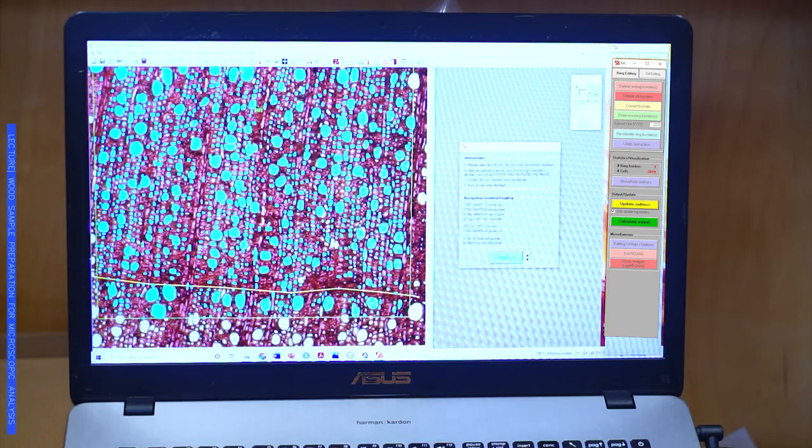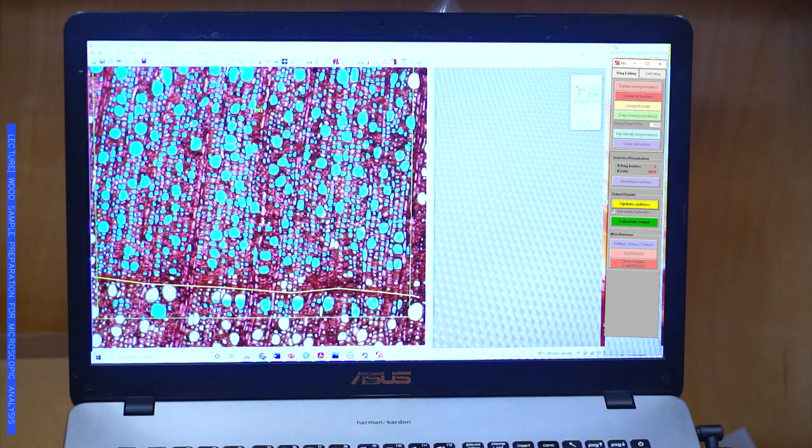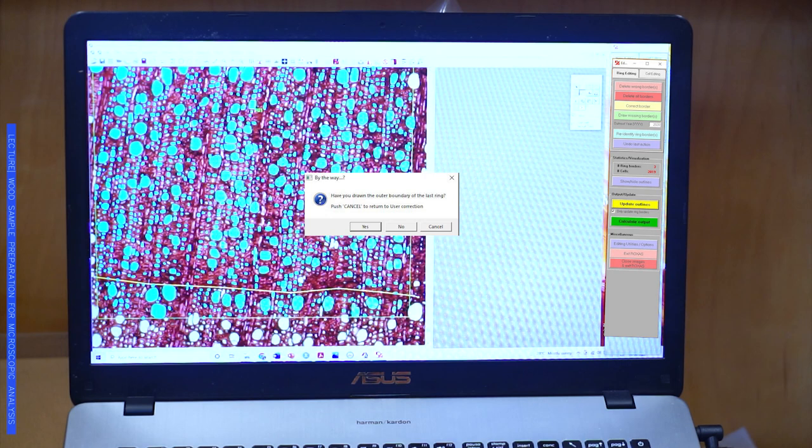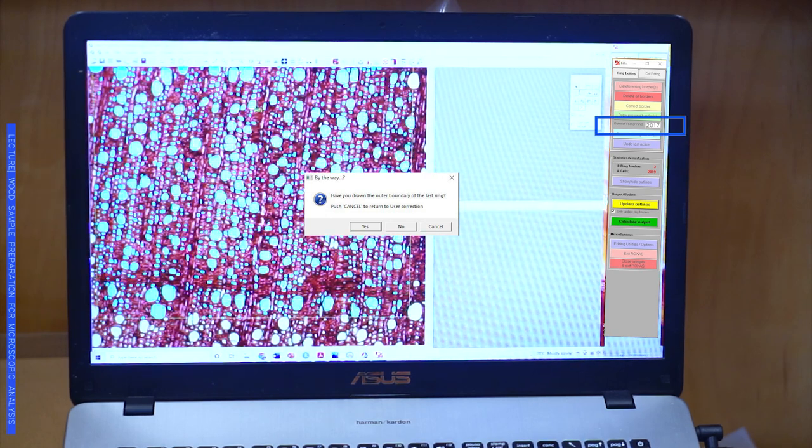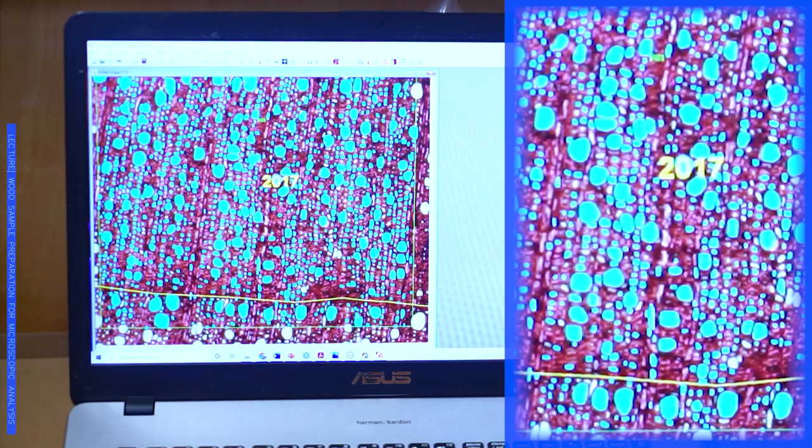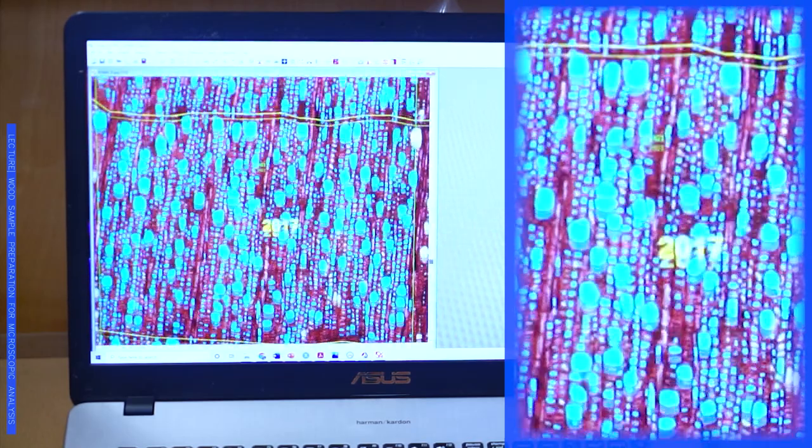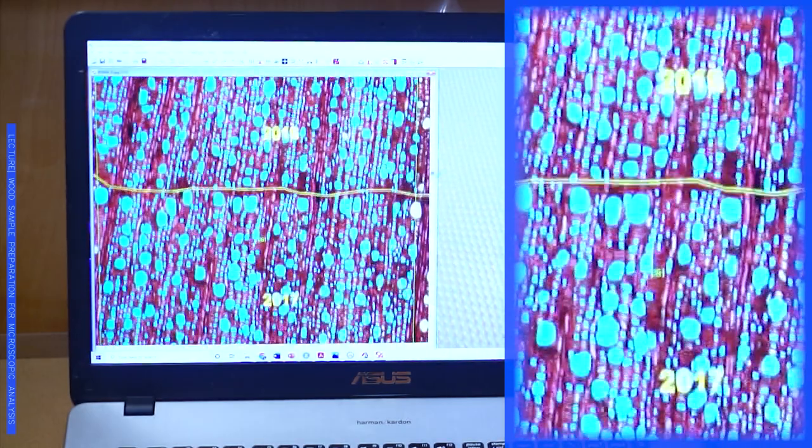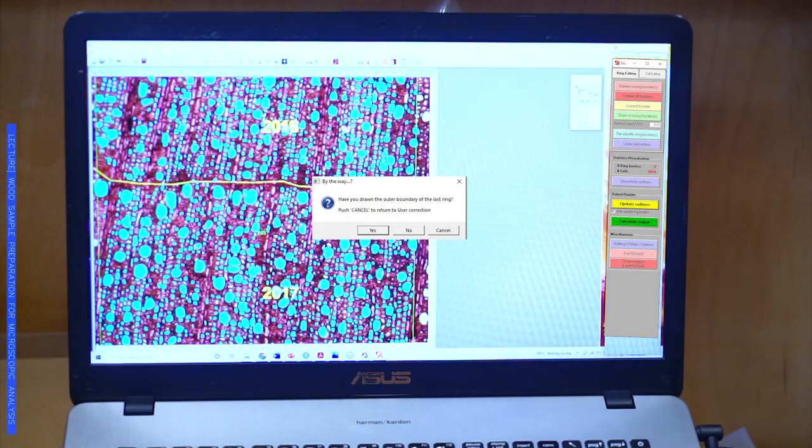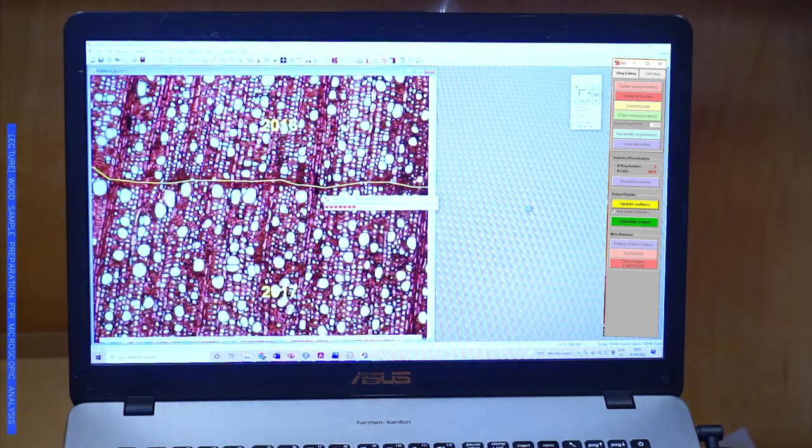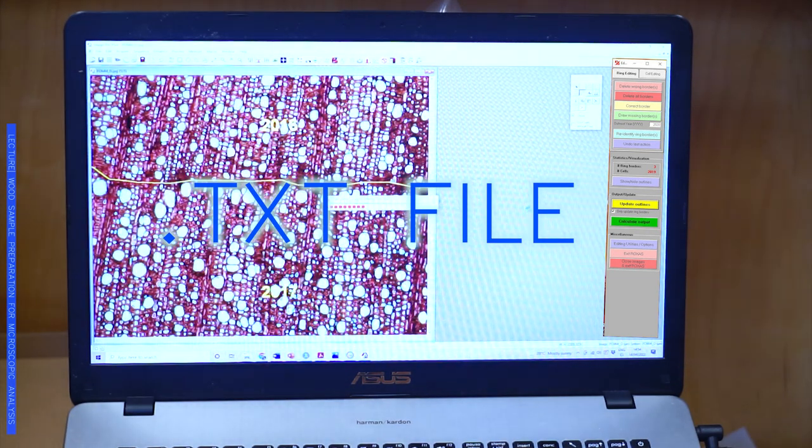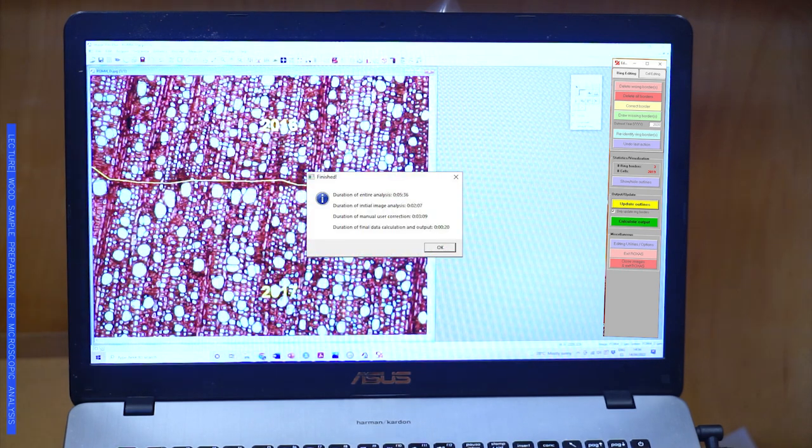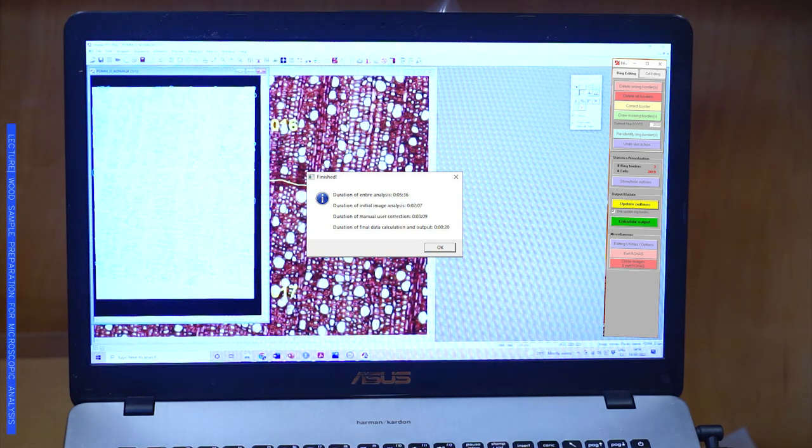In this case, we collected them in 2017, so I can just put here 2017 so that it will already give me the years. I have to update it. Here you can see already the program has assigned the year of study 2017, 16, and just one piece of the 15. After that, it's just a matter of calculating output. The program will give me a TXT file and also if you want an Excel file with all the different anatomical traits that this program is capable of measuring.